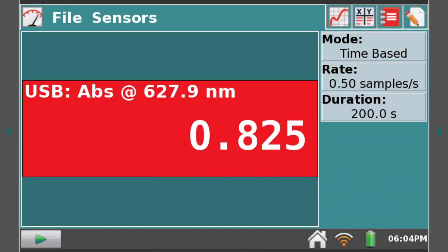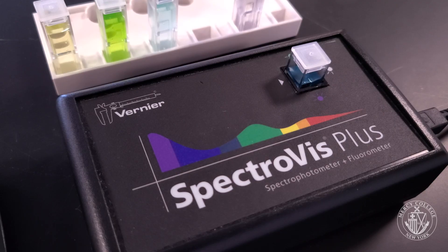Our fourth drink sample of cool blue looks to have a stable absorbance reading of 0.826.